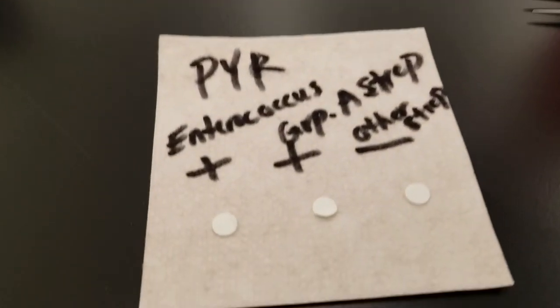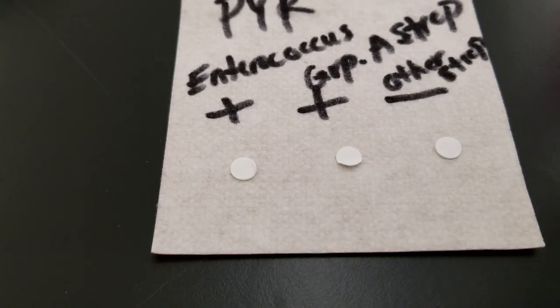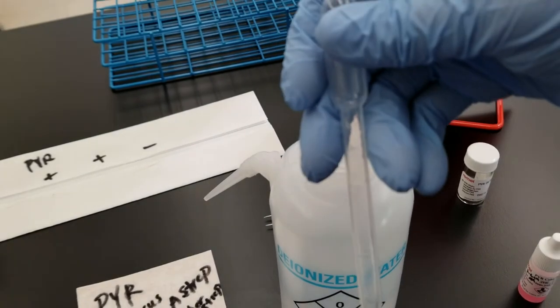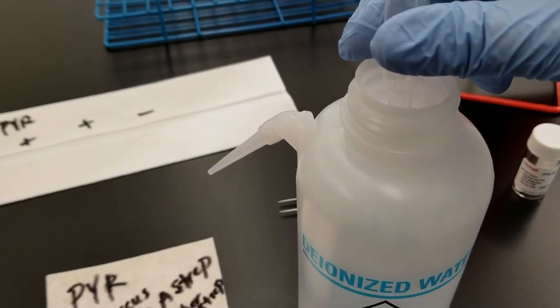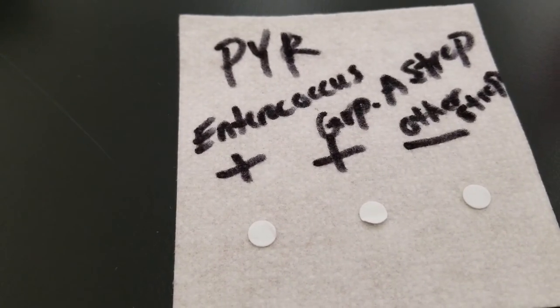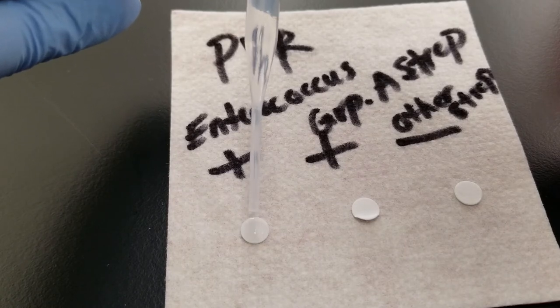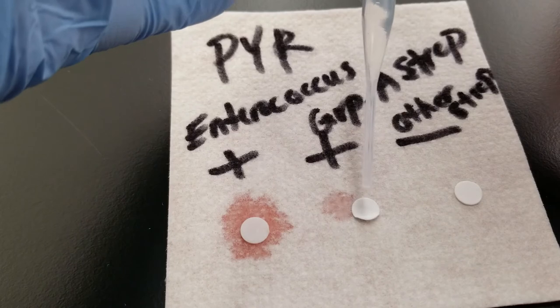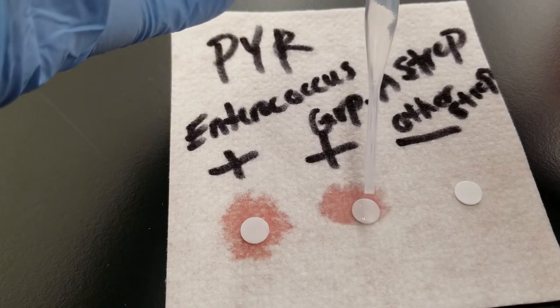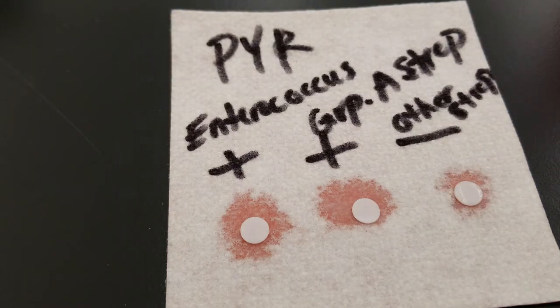I have a clean transfer pipette and we're going to do four drops of water on each of those pads so that the substrate is easily used. I'll add four drops to each pad. Now you can see what I'm talking about with the orange coming through, and we're looking for a red color at the end, so that's why that could be difficult.